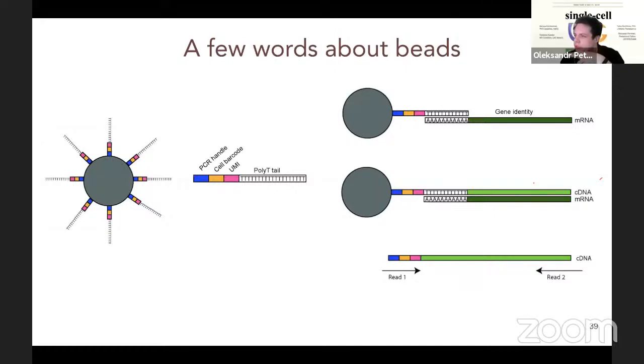Yep, and we still have a few more questions regarding the UMI. For example, are UMIs used to determine in the final data set what type of RNA is present in the cell? That's an interesting question. UMI is used in raw reads processing and read calling, when you count the number of UMIs for a particular type of RNA. That is why in your final data set, the count matrix we will work with in our practice, you will see the type of mRNA. Thanks. I think this definition provides better insight on how UMI works. Thanks for the presentation.